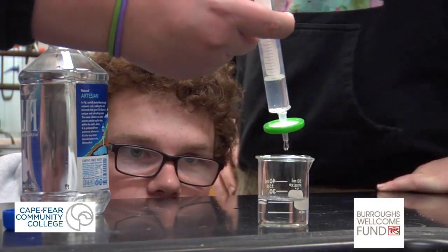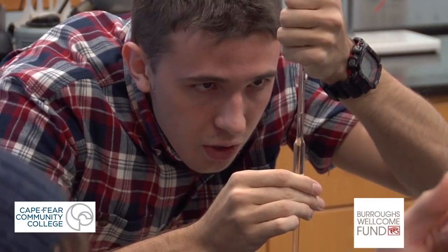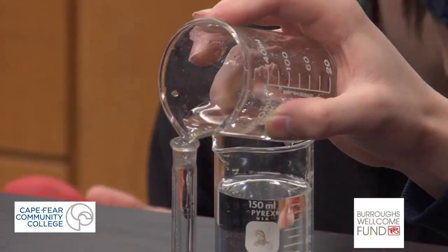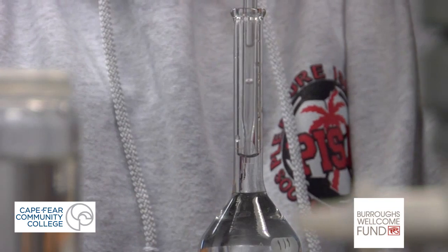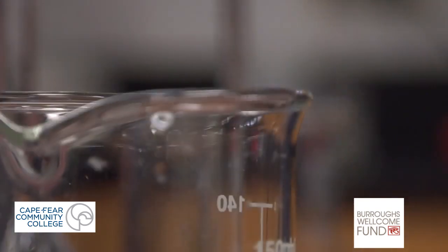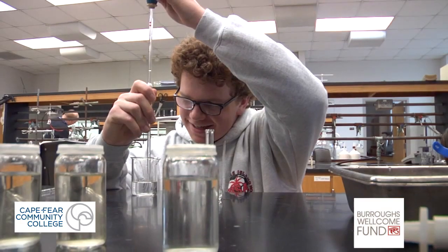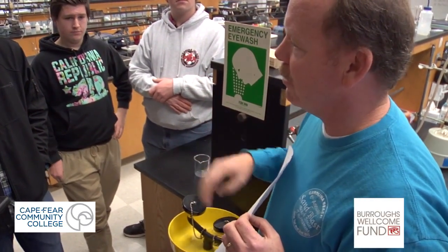You'll squirt it into a sample container that you'll keep that will be eventually injected onto the machine. We are looking for a couple of elements. So we're looking for lithium, calcium, magnesium, potassium, and sodium. And we're looking for them because those are minerals. Fiji and Smart Water and places like that, they can say that they have them, but a lot of times you don't know how much is in there. And so we're just trying to compare, is it worth spending the money on Fiji when it's maybe a small container, or getting a big bottle of Dasani or Deer Park? Is it the same amount? We need precise measurements, because if one of these is off, then the whole standard's messed up, okay?